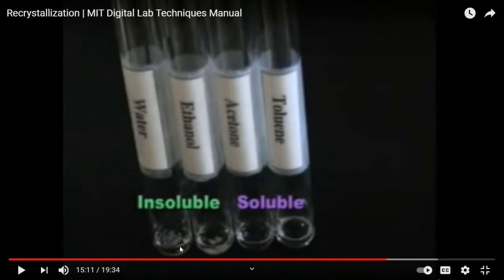Okay, why do you even consider this thing, right? You do crystallization in your professional lab to purify some compound to 99.99% purity.